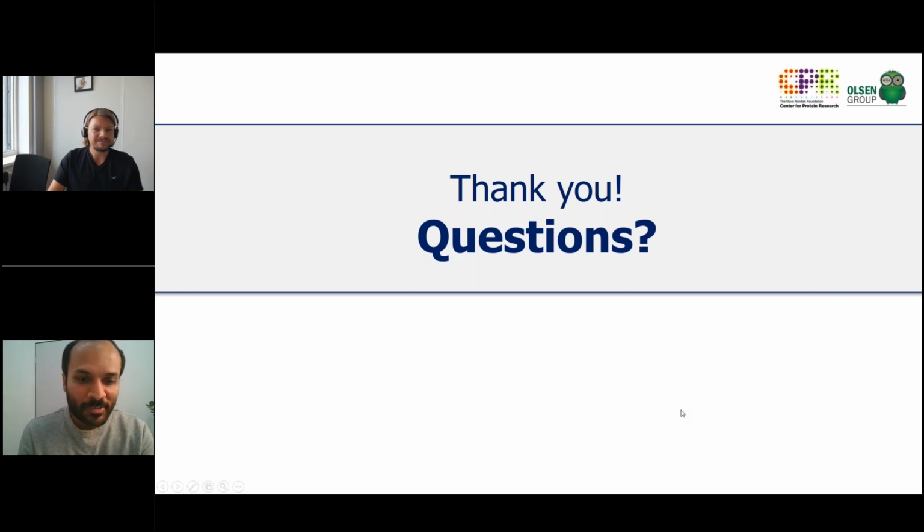Hey Jesper, thanks for the great talk. It's always really exciting when external people find the same results as what we hope people will get. So that's really good to hear.